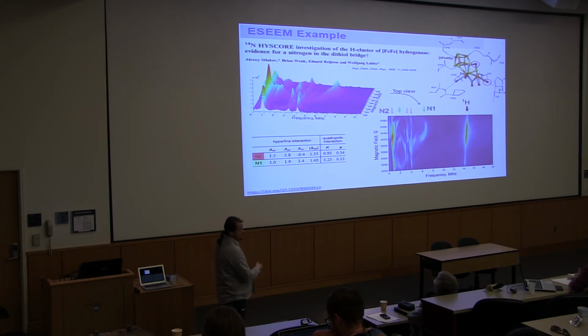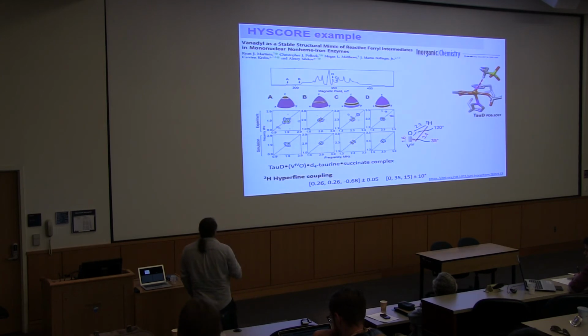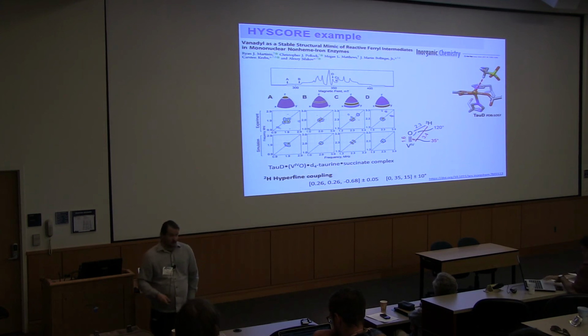And that was very important because this nitrogen is what accepts the proton after heterolytic splitting of hydrogen in this system.